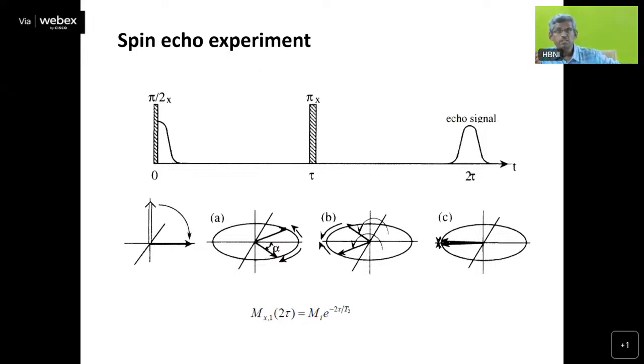There are experiments to calculate the pulse width for 90-degree and the pulse width for 180-degree. These are simple experiments. You measure the intensity as a function of pulse duration, and whichever pulse gives the maximum intensity gives us a 90-degree pulse, because normally the detector is mutually perpendicular to the carrier wave frequency axis as well as the applied magnetic field.